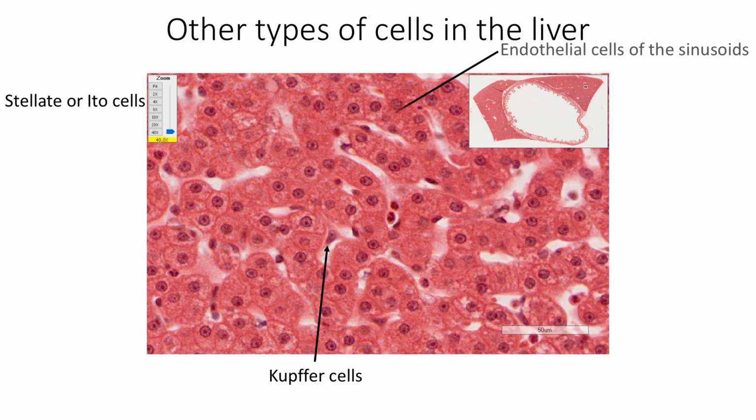We also find endothelial cells which are lining the sinusoids. These are fenestrated flattened cells with a central nucleus. Cholangiocytes are the cuboidal or columnar cells with apical microvilli, and these cells are found to be lining the biliary ducts.